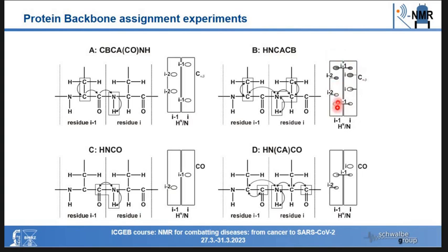And if you have done this, you then can basically compare all these strips, we call these things strips. You can compare all these strips and put them in an order and say, okay, this strip must be behind this because here I have these two that fit so nicely. I have here this own peak, the big peak, and here I have the smaller peak that's at exactly the same height, so I know they have to be behind each other. And that's why we make 3D spectra, and that's what's nice about 3D spectra.